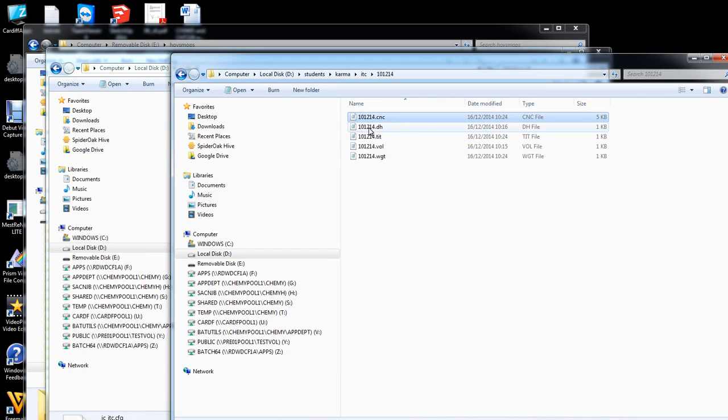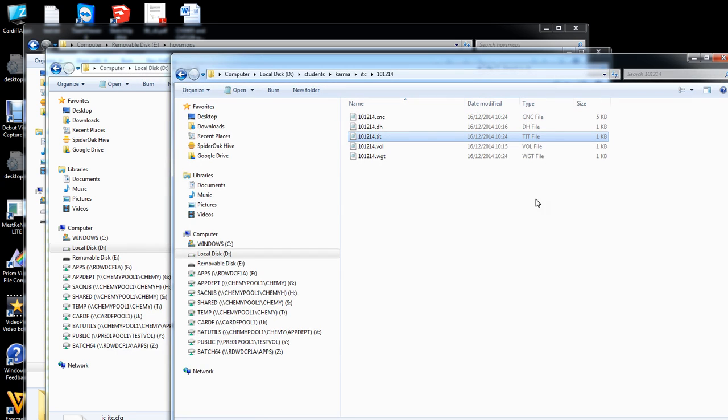You can have a quick look at the other files. The delta H, the heat effect file, is still exactly as we made it earlier. The volume file also hasn't changed. The other file, this file, is the titration file, and it basically says that all of the different injections belong to one titration. They're all the same titration. And there's the weight file, which says the first injection is not counted, but all the other injections have a weight of 1. Now this is something that we want to change, because we concatenate the two titrations, so there is a second first injection. So we are also going to set the weight of injection number 20 to 0 as well.